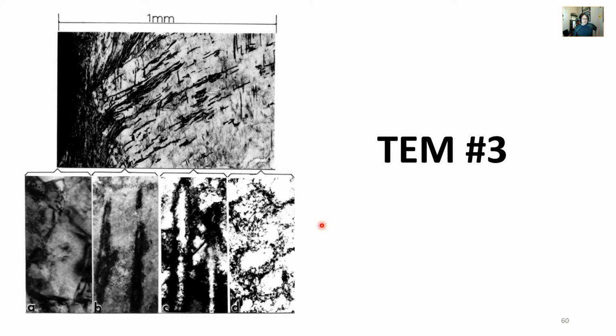There was a time where I was involved in a project dealing with titanium, and you had two data sets that had pretty much the same grain size, but one data set had drastically different yield strength. We did some TEM and found that there were more dislocations in the sample set with higher yield strength.